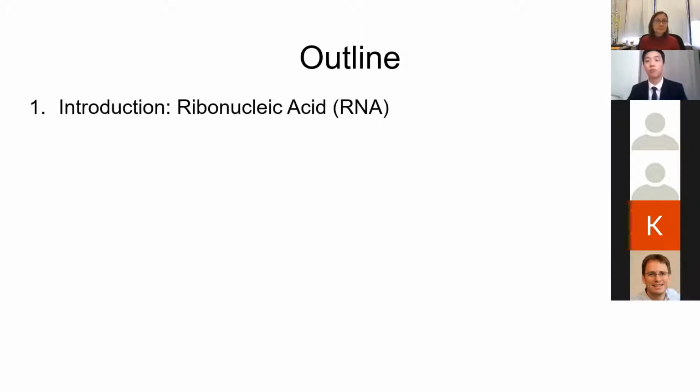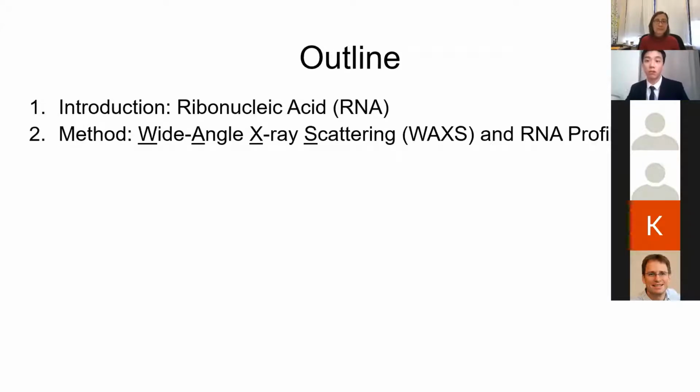So here's the outline of my talk. I will first give an introduction on the RNA and why we should care about RNA molecules. Then I will introduce a new method called wide-angle X-ray scattering to study RNA molecules and show you how the experimental data look like. And because this wide-angle X-ray scattering is a new and less employed experimental method, there will be unsolved problems, which will be the theme of this talk.